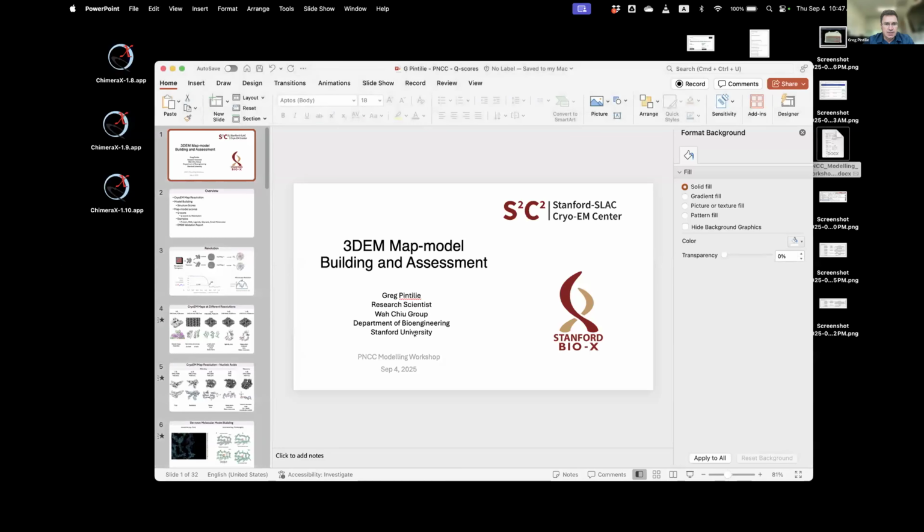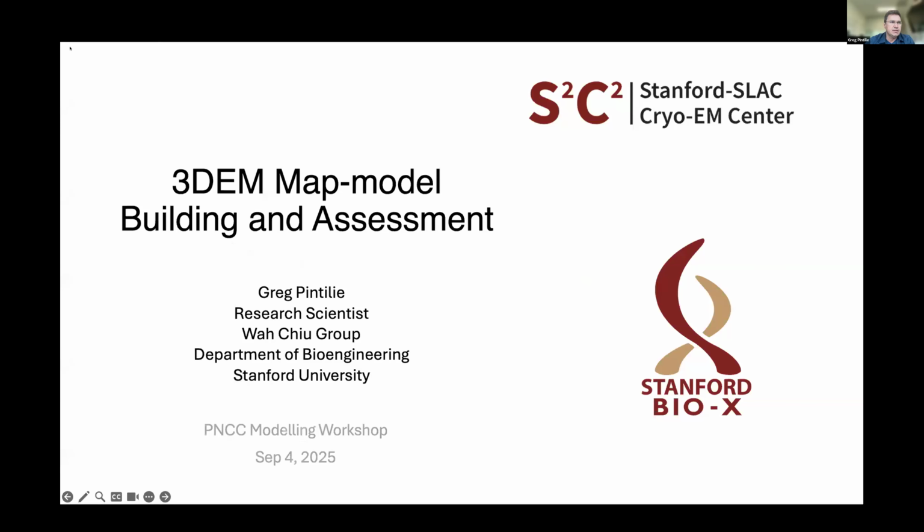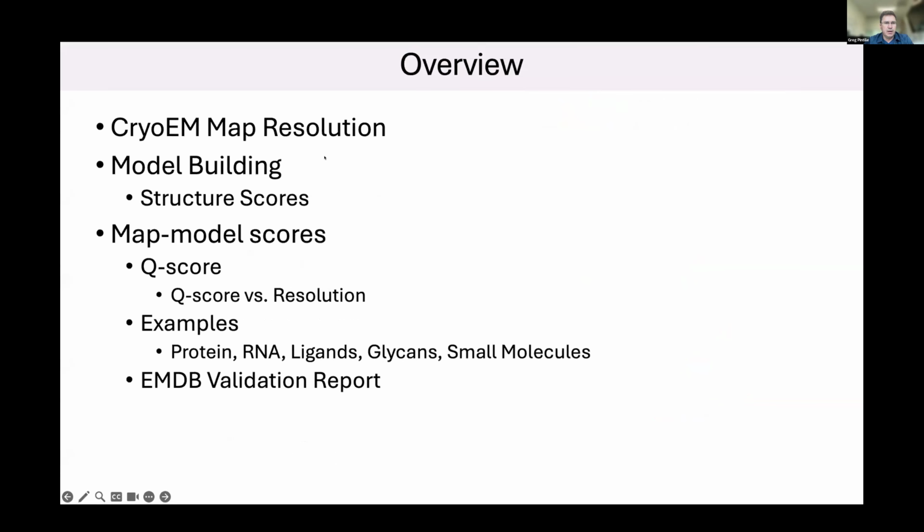Okay, thank you very much for having me. It's been a pleasure watching all the presentations so far. So we'll be following along the main themes of map and model building and assessment. Because this is about assessment, I'd like to briefly review resolution, because that's a very common method used for assessing a map to begin with. Then I'll show some examples of model building, a lot like what we've seen already.